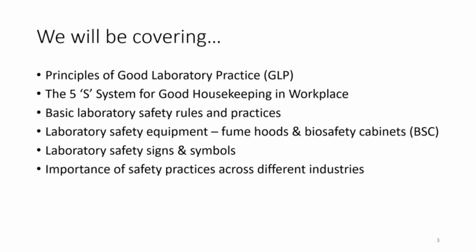The lecture recording for this topic will be divided into a few videos. Firstly, we will spend some time to look at good laboratory practice, followed by the 5S system for good housekeeping in the workplace. And lastly, we will also look at the safety practices in the laboratory and also across different industries.